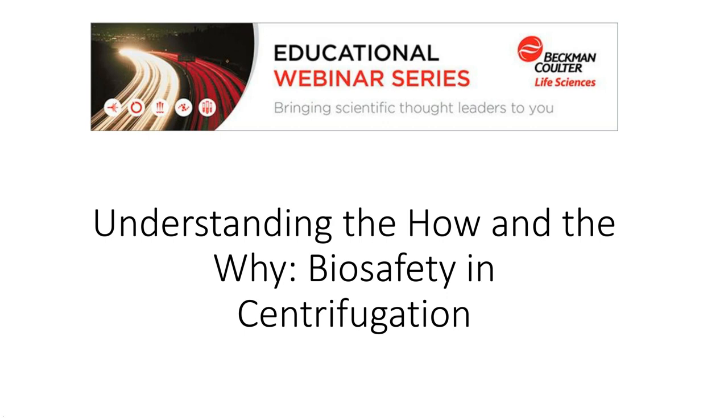And Bob, you probably have something to add to that. Yes, and during the talk, Laura and I both talked about how G-force multiplies the mass of what you are spinning. And that's the thing to keep in mind, how much mass is being spun at the forces that are being applied. Think of that as a multiplier. So any differences between one side and the other side of the rotor are multiplied by the amount of G's that are being applied to that spin. So that's really the thing to keep in mind: what is that difference, and minimize that difference, certainly to within tolerances, but even better than that if you can.